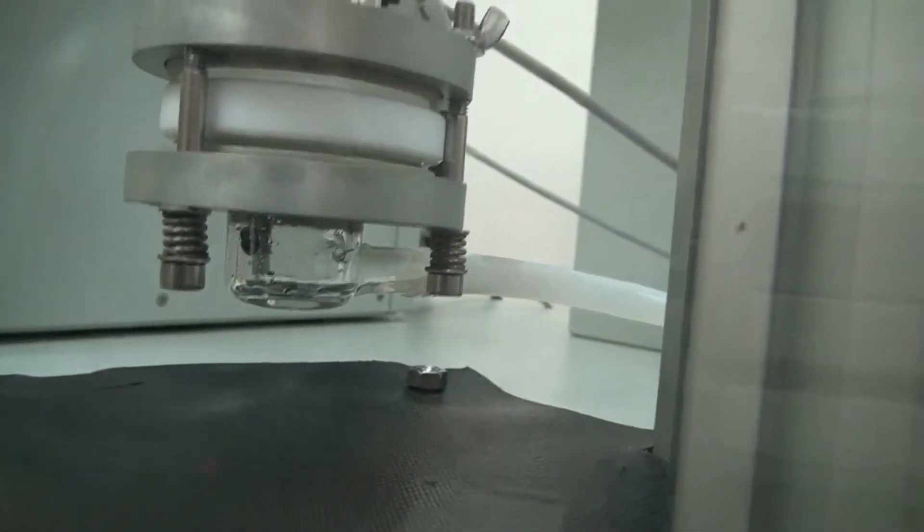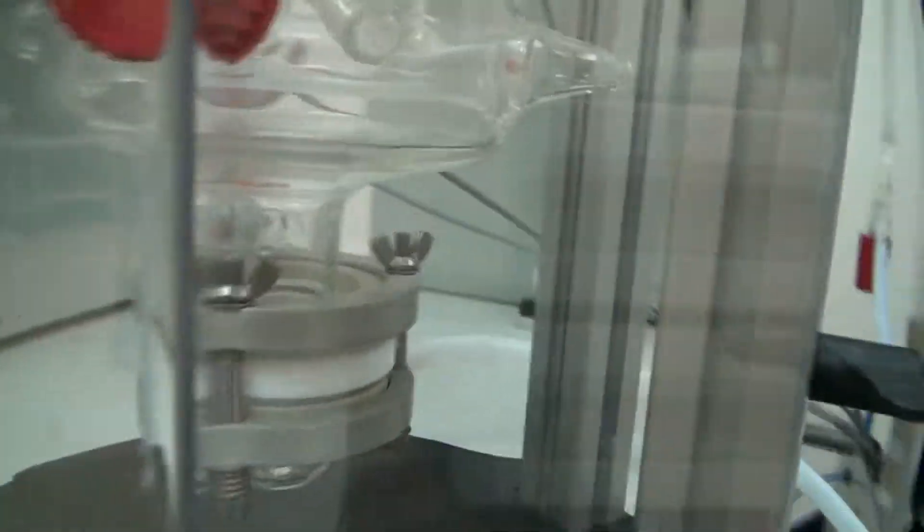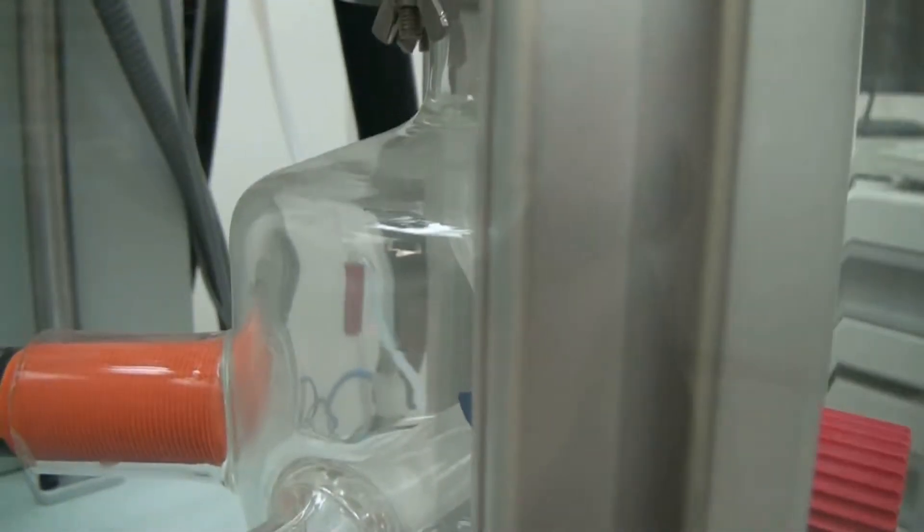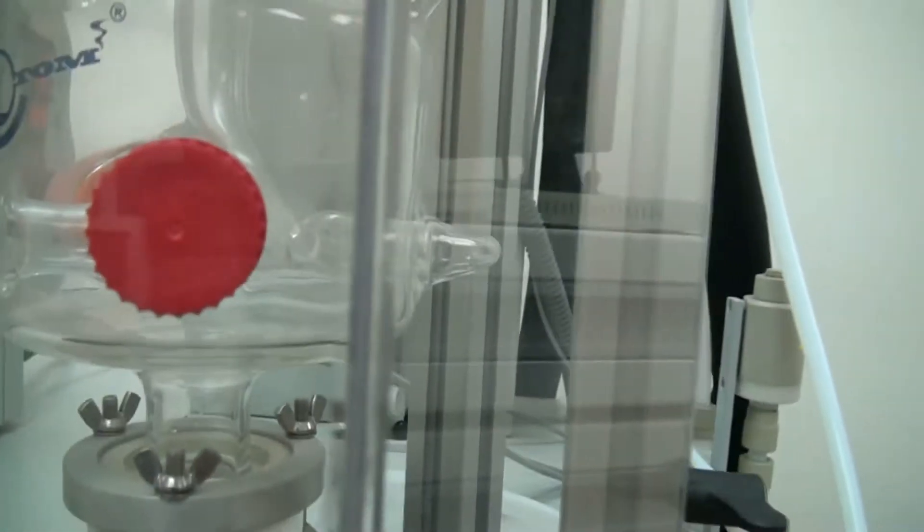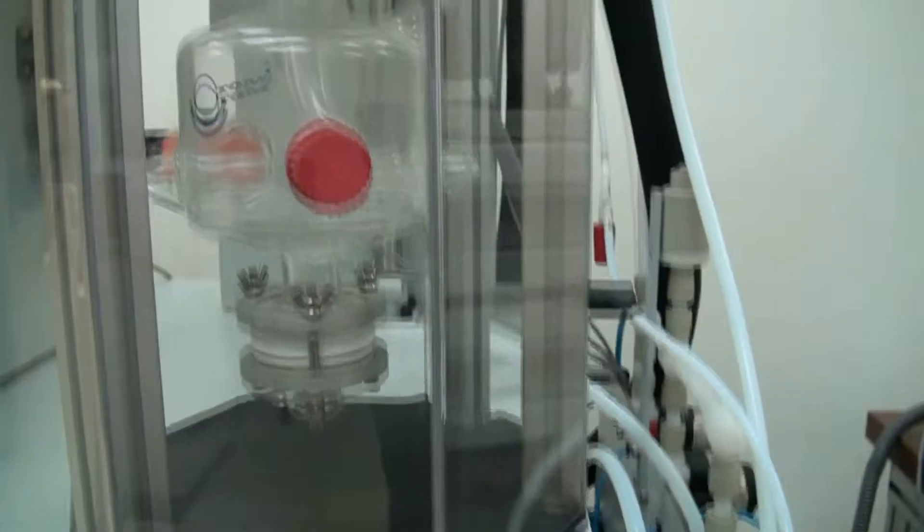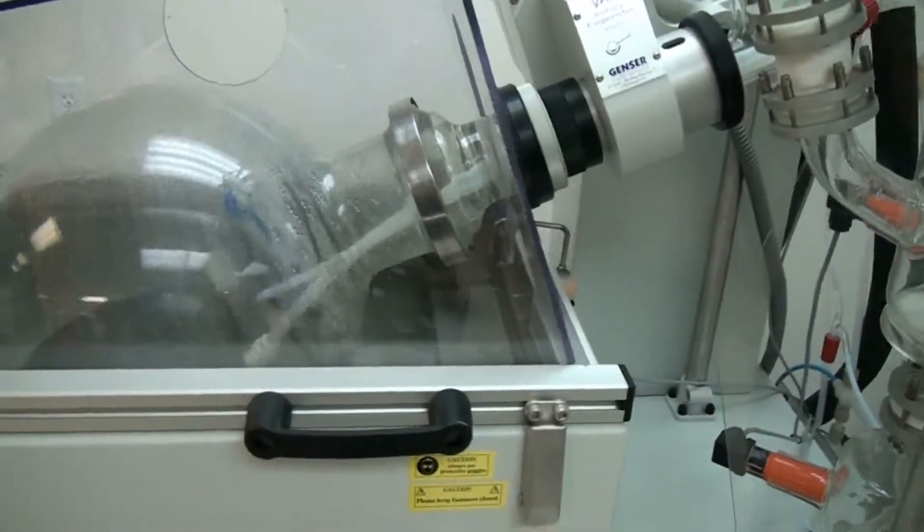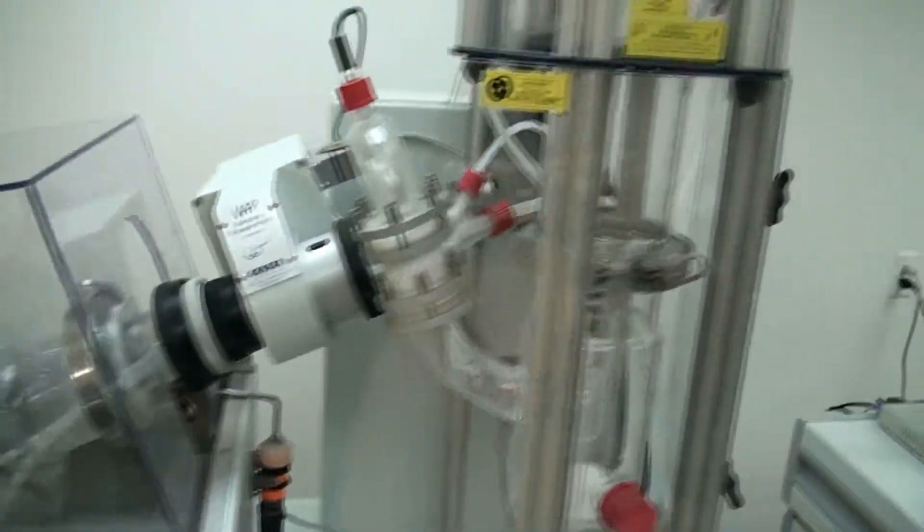That's where it would actually drain and then it knows when it needs to drain because of this sensor over here. So if it was filled up to that point then it would actually open the valve and drain that down to a point where it was below the sensor and then it would continue on evaporating. This is made to just continually run non-stop.